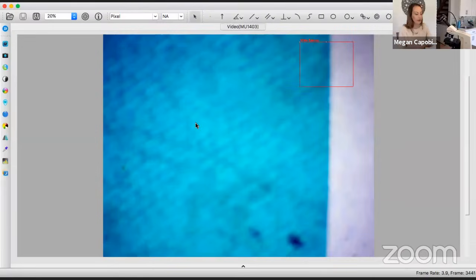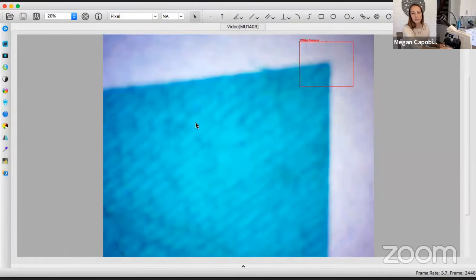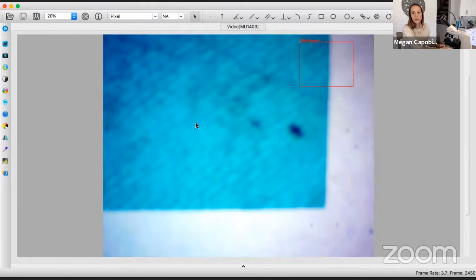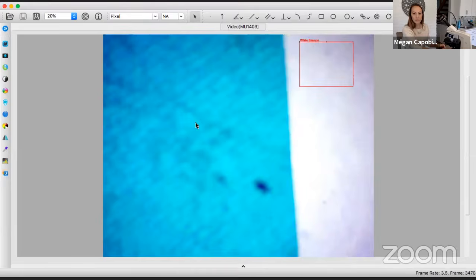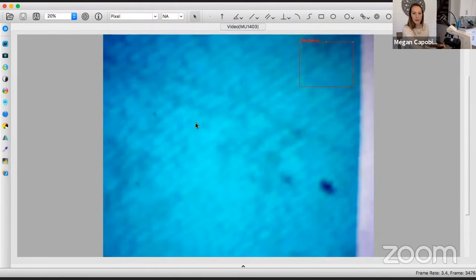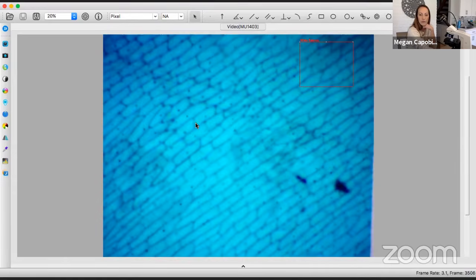All right, so I'm just going to first put this in the middle. And now if you'll just be patient with me for a moment while I get the screen up. All right, awesome. We're already seeing something. Okay, we're just moving things around. I'm going to go the other way. And now we're just going to focus a little bit more, trying to get a clearer view. All right, awesome.